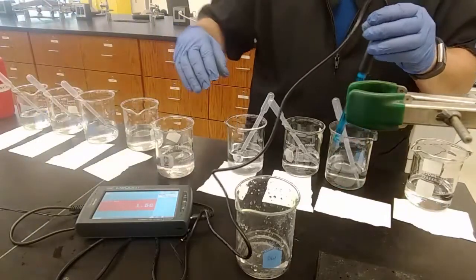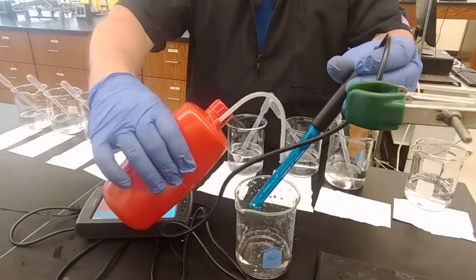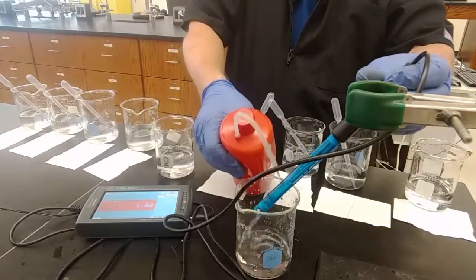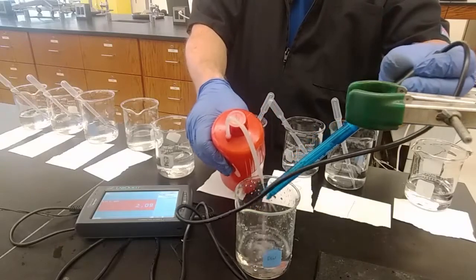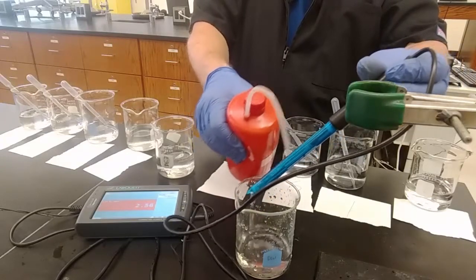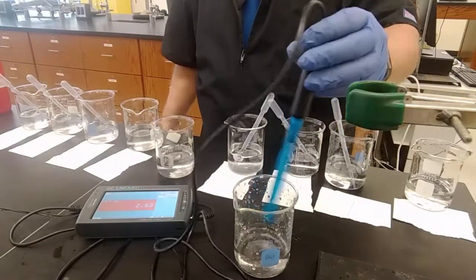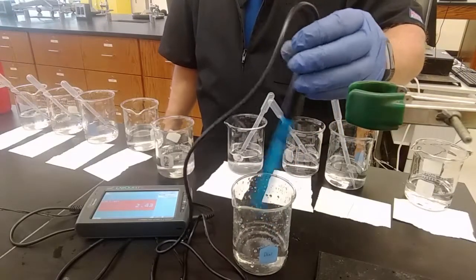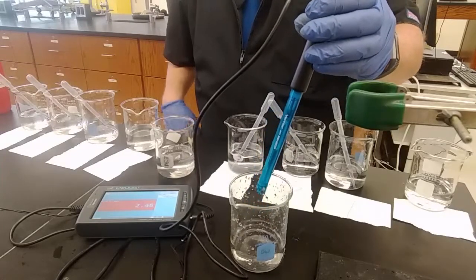Let's see if 0 truly is 0. We might be hitting the limit of our meter as well. That's another issue. Electronics have limits, have measuring limits. And when you get to the extremes of the limits, another reason that Beer's law in that spectrophotometry lab only is valid technically between 0.2 and 0.8 is below 0.2 you start to hit the limit of the instrument.